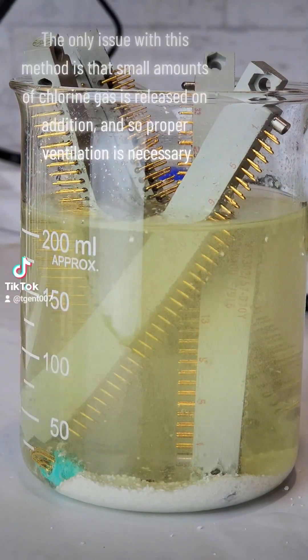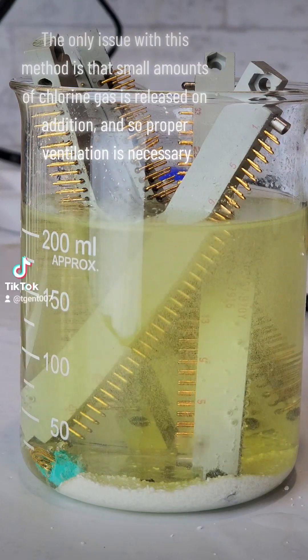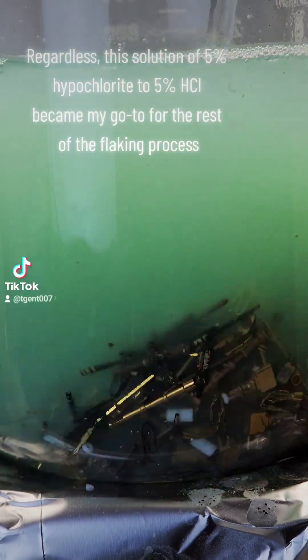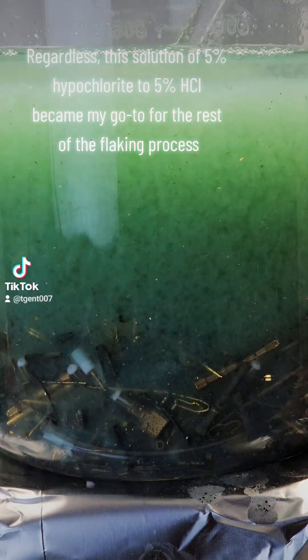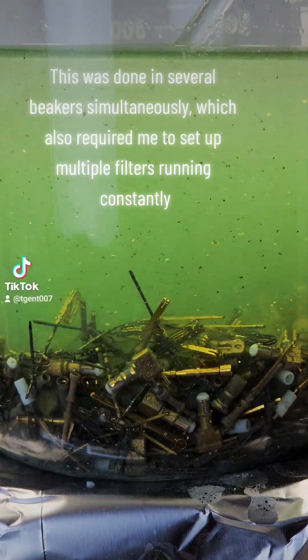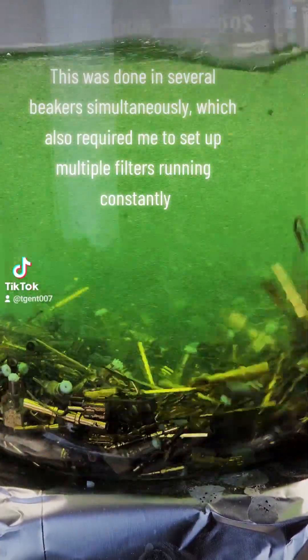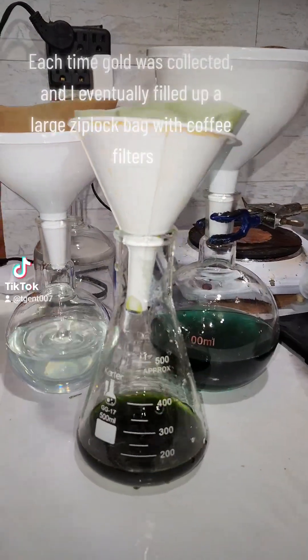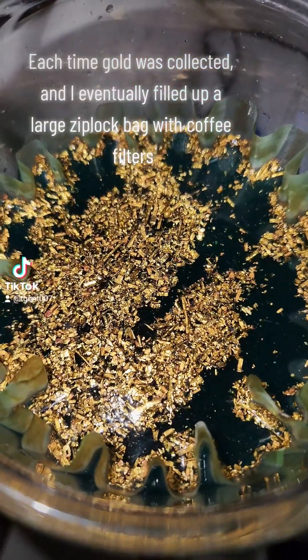The only issue with this method is that small amounts of chlorine gas are released on addition, so proper ventilation is necessary. Regardless, this solution of 5% hypochlorite to 5% HCl became my go-to for the rest of the flaking process. This was done in several beakers simultaneously, which also required me to set up multiple filters running constantly. Each time gold was collected, and I eventually filled up a large Ziploc bag with coffee filters.